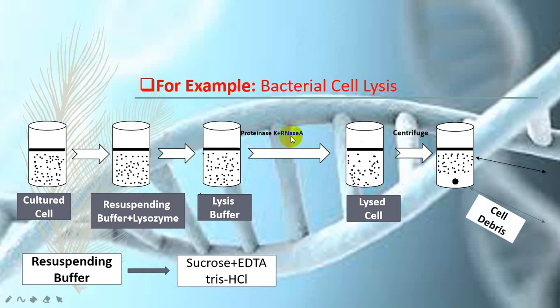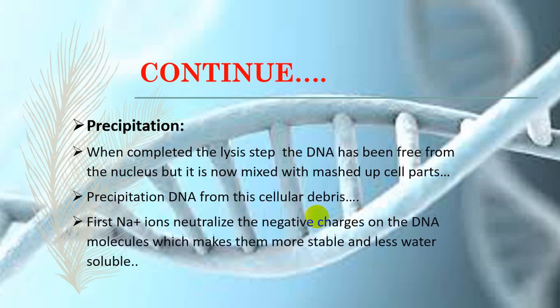These both are added, and then the cell is lysed, the cell is broken down and then centrifuged, and cell debris are separated and intracellular components are separated. And then resuspending buffer and sucrose. These are as I have mentioned that there are different mechanisms for different types of cell, but the basic phenomena of every cell, every DNA extraction from the cell is the same.